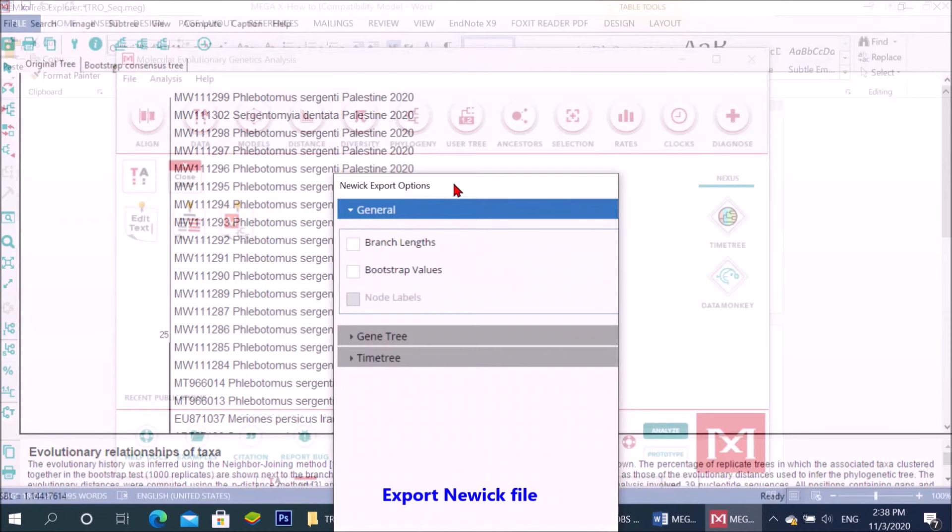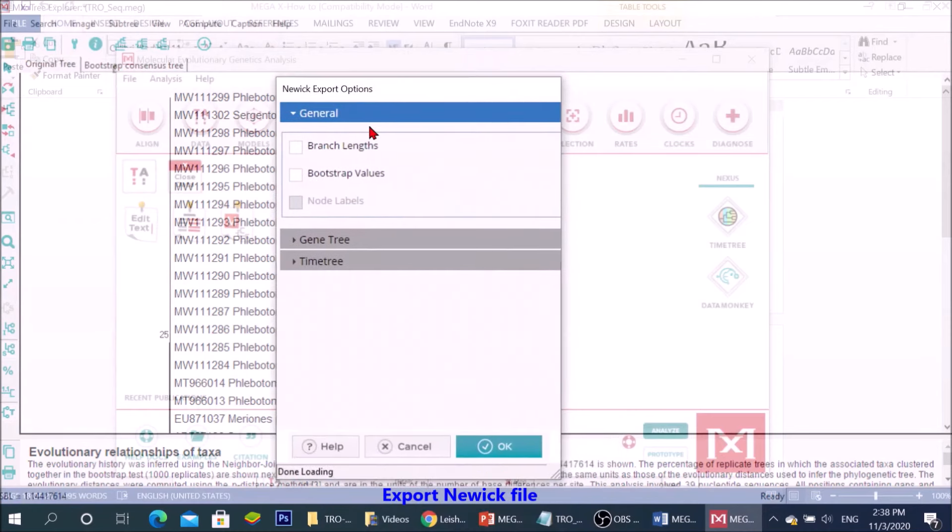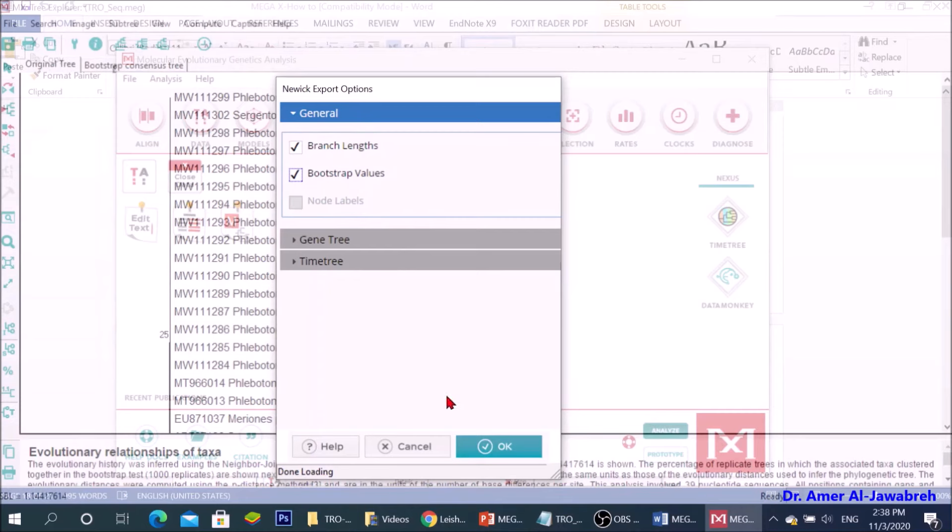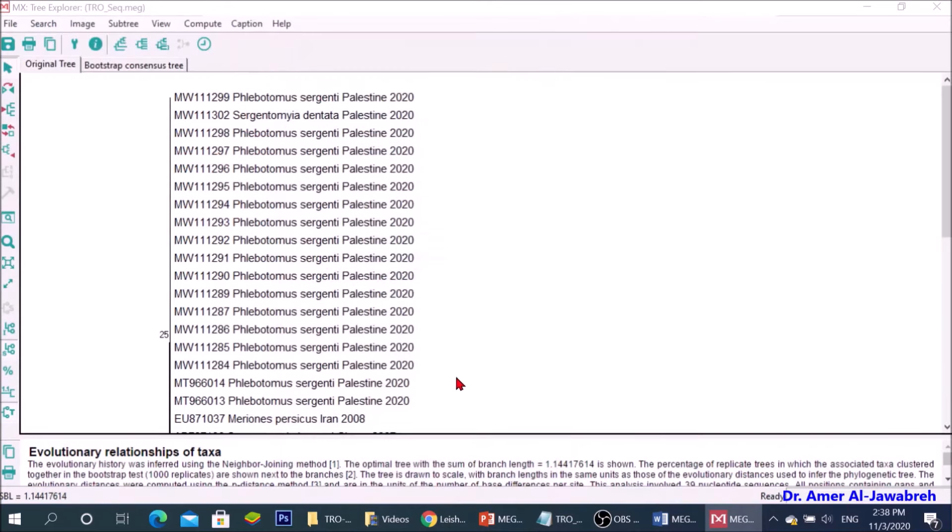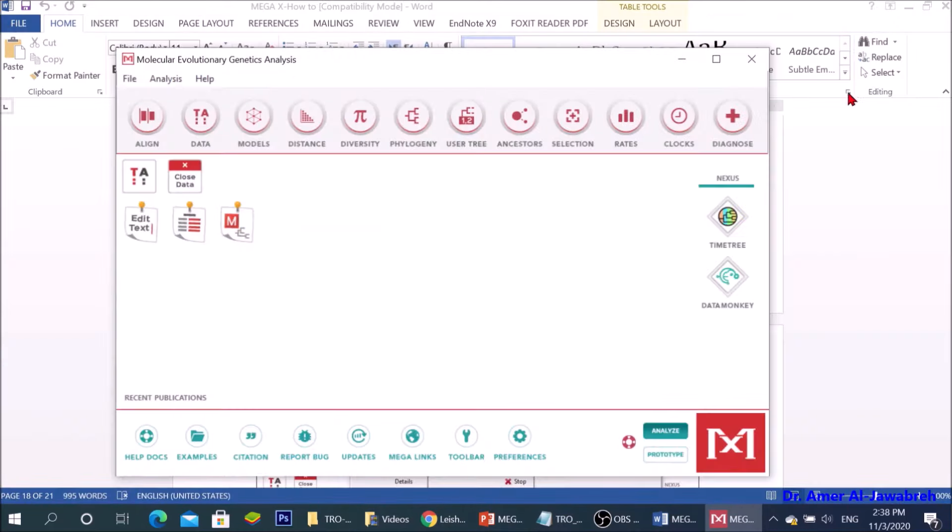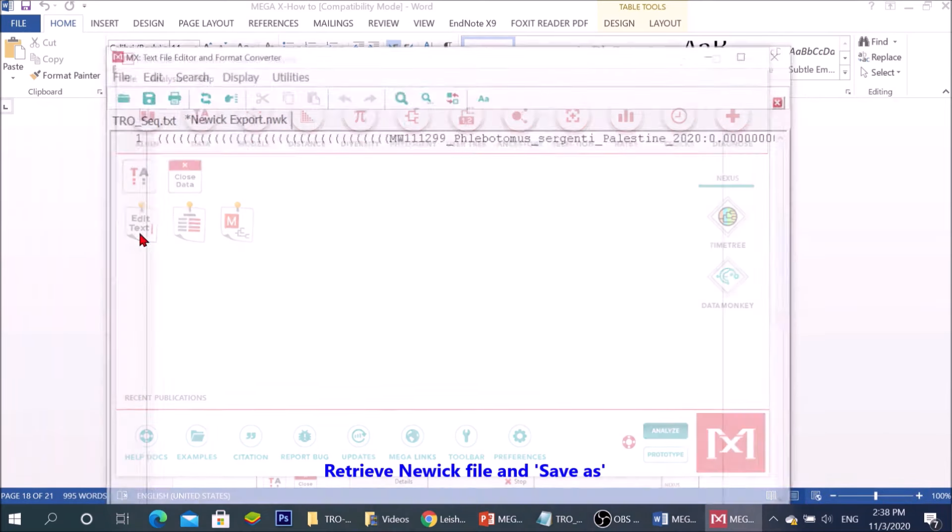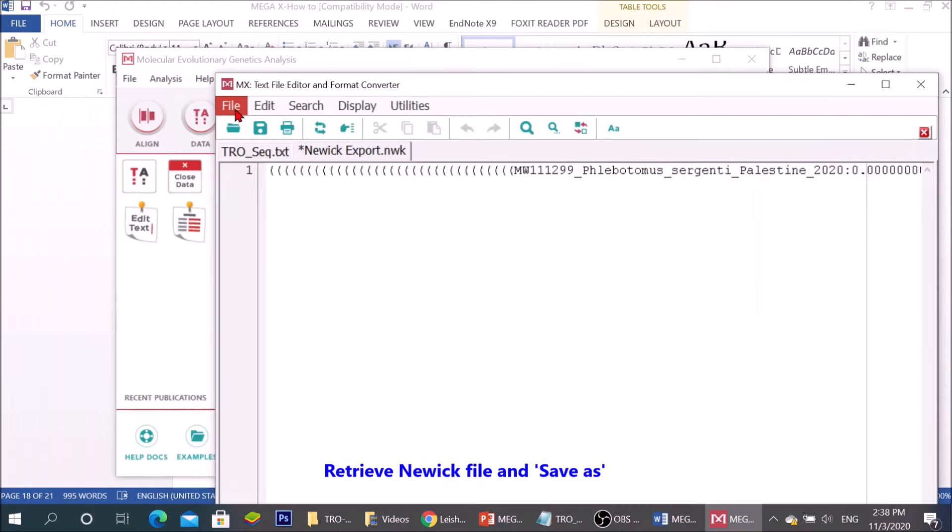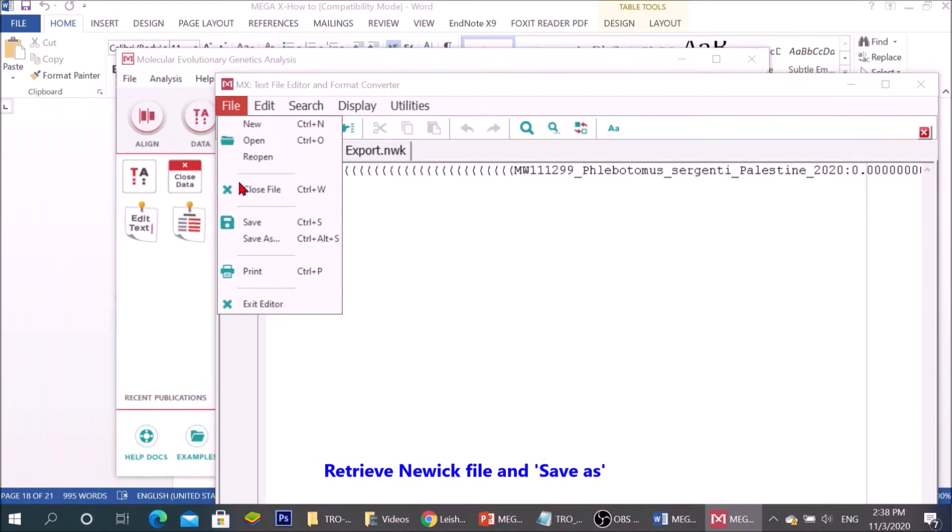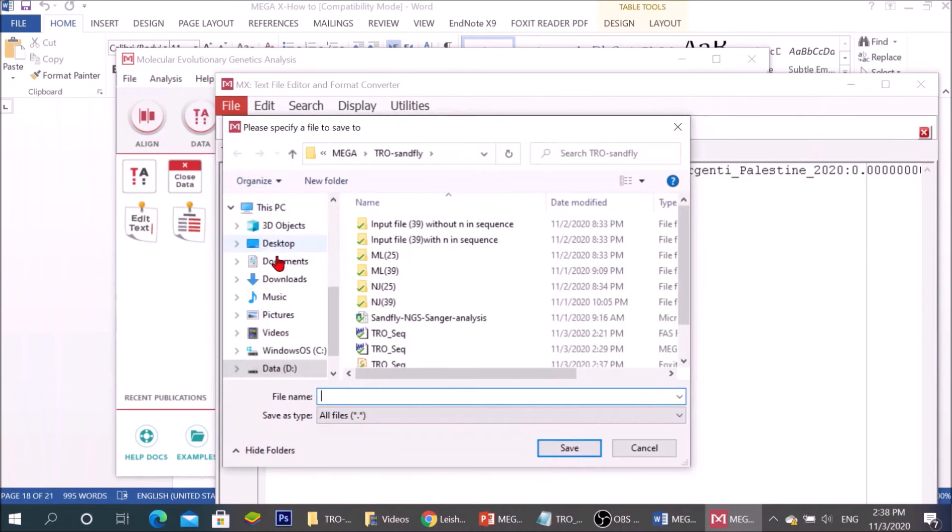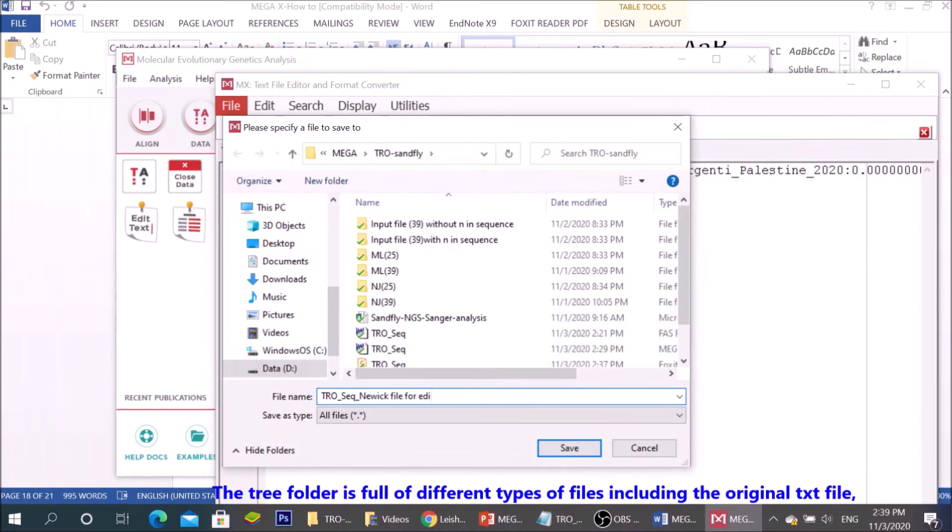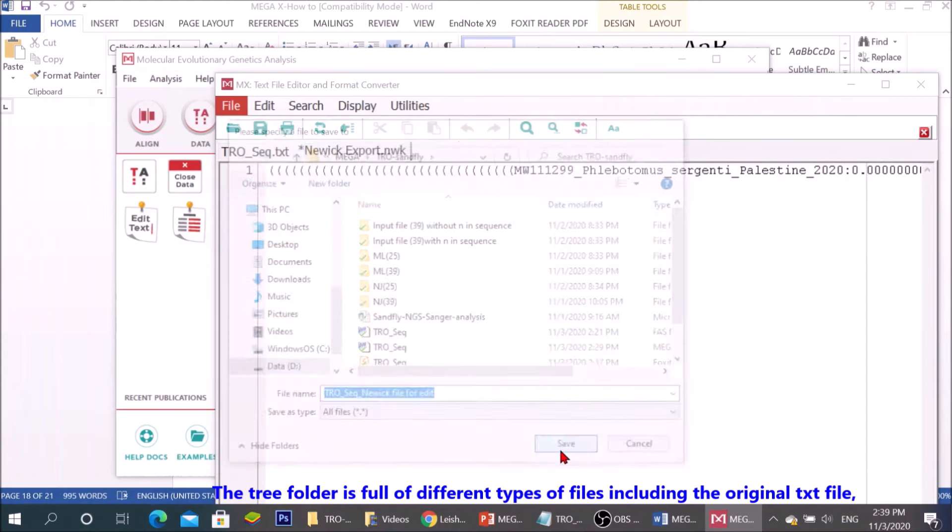Export Newick file, retrieve Newick file and save. The folder is full of different types of files including the original TXT file.